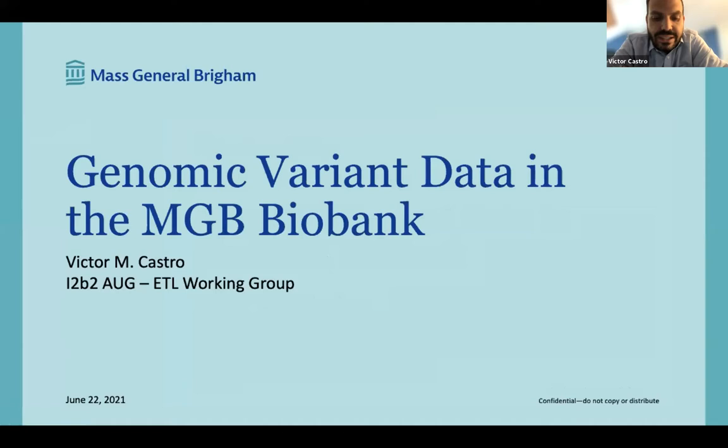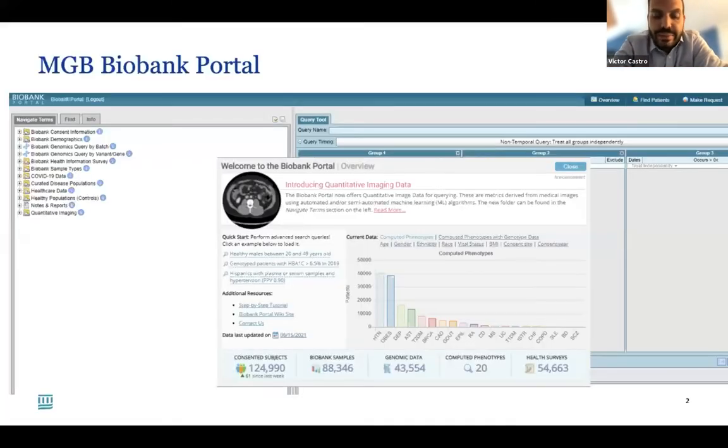So I just want to talk to you guys a little bit about loading genomic variant data into the MGB Biobank, which is an I2B2 instance. So just a little bit about the biobank.